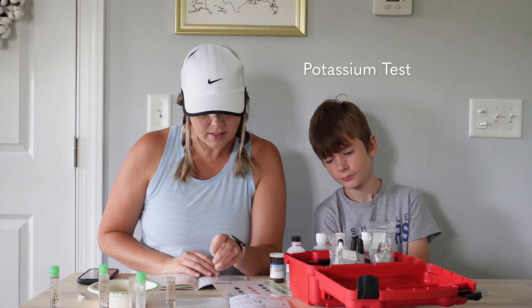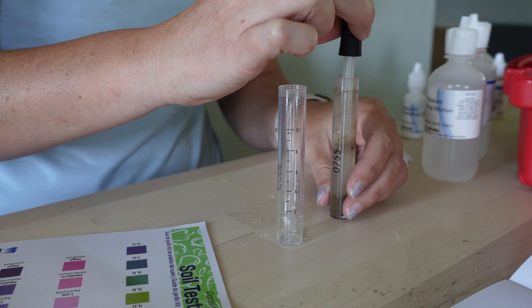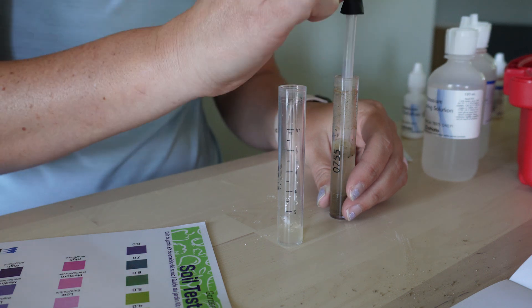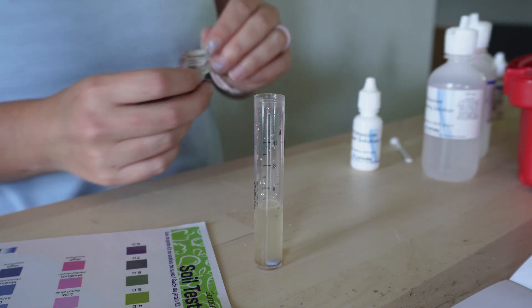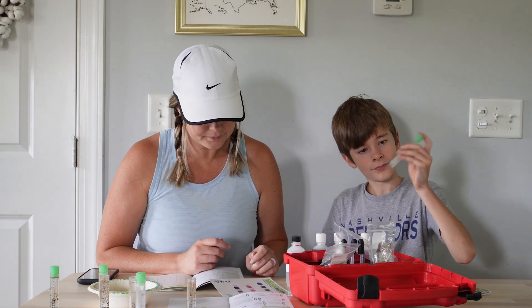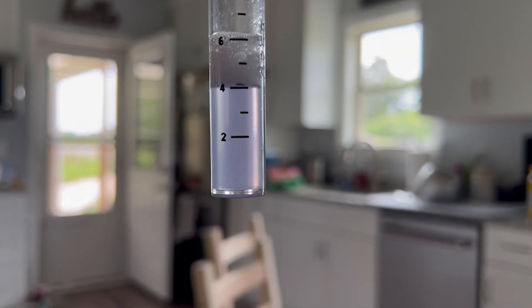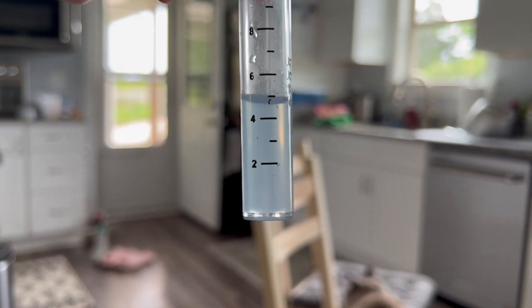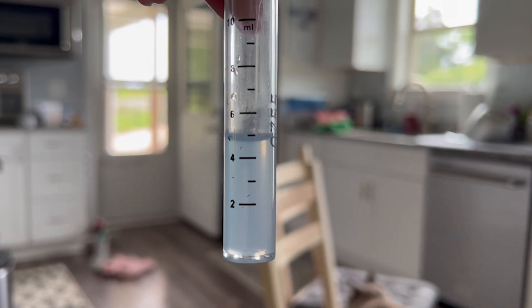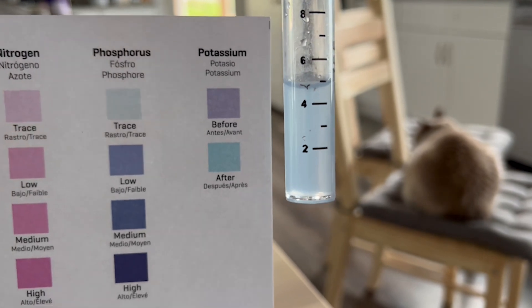Next is the potassium test. Fill the second tube to the five milliliter line with liquid. Add one potassium indicator tablet and mix it around until the tab dissolves. It's kind of a purplish color now — we're supposed to add drops until it becomes blue. One, two... so 18 drops it is, which is low in potassium. You can see that it went from purple to that blue color.